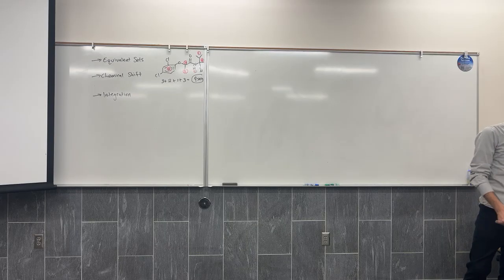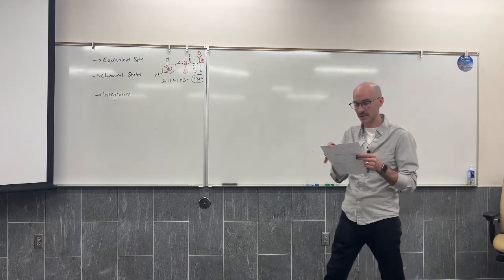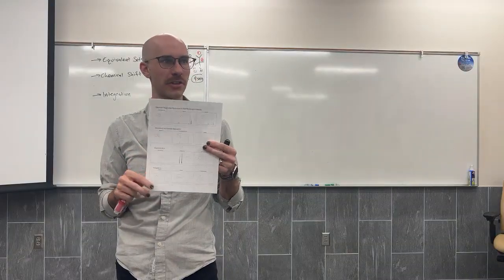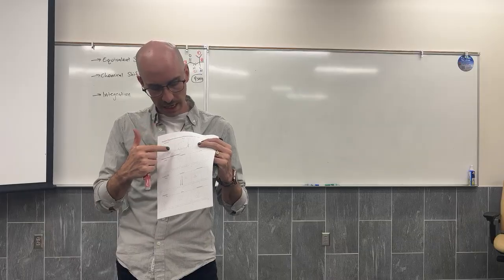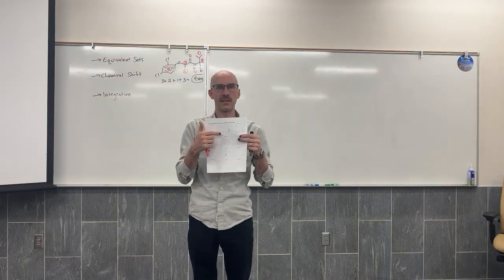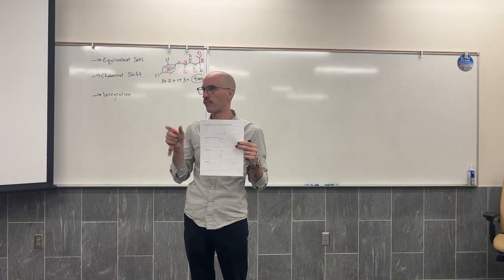Okay, so we can't necessarily get in here and assign these signals, especially with how small this spectrum is and how blurry it is. We're not going to come in here and try and assign any signals, but we understand that there probably is some stuff going on here. Actually, I think there's one we can assign. Do you see that signal around 4.6? And the correlation table tells you a signal around 4.6.